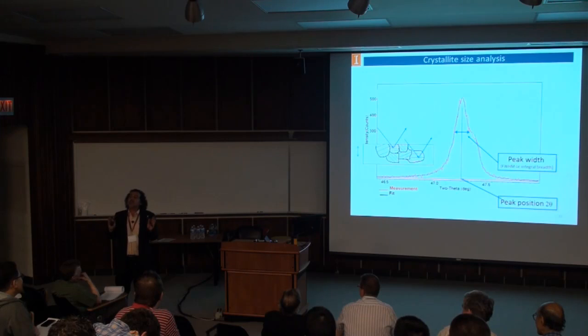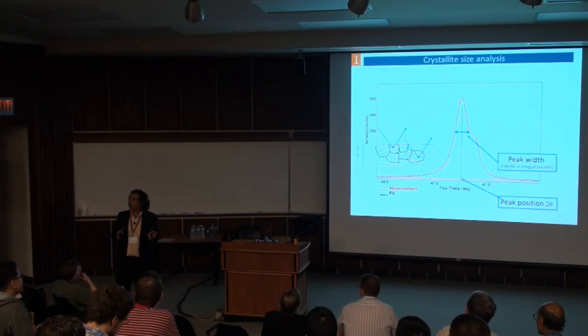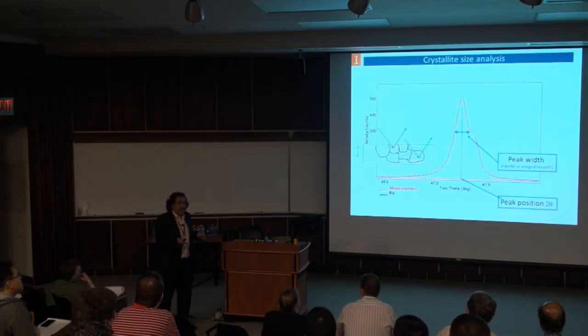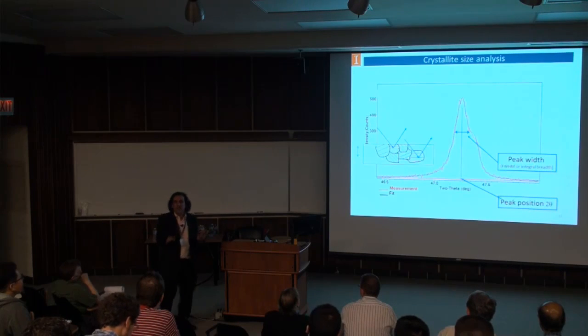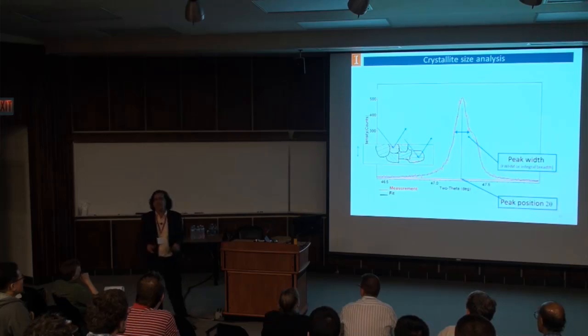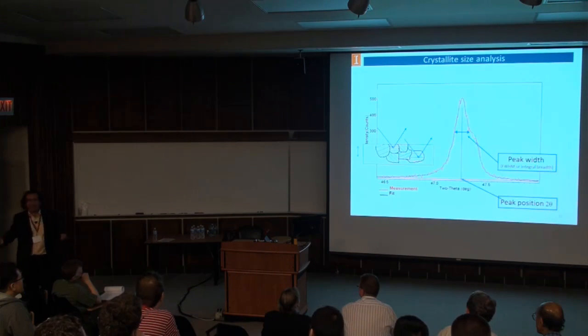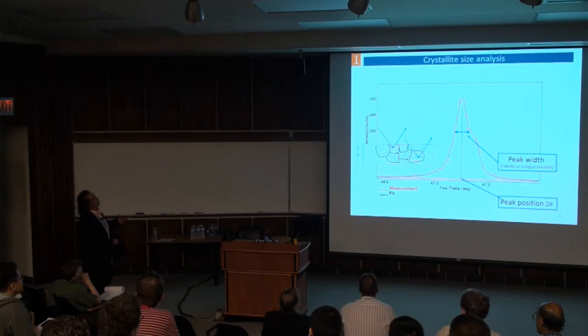You have to understand what the assumptions are in the different techniques. What you are actually measuring. Are you measuring exactly the same thing? Is the direction the same? Then they calm down a little bit. It's almost like doing therapy. You have to be a little bit of a psychologist, a shrink, and you have to talk to people, calm them down. But let's see what's going on here.